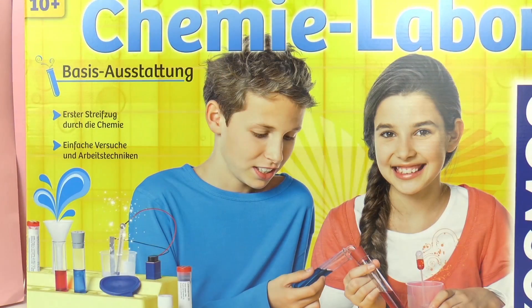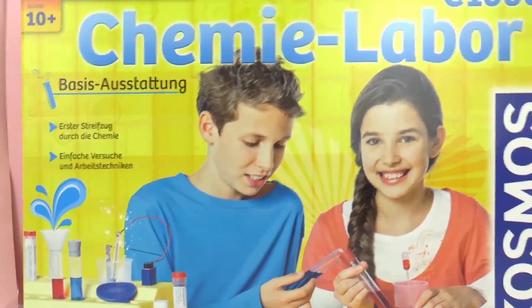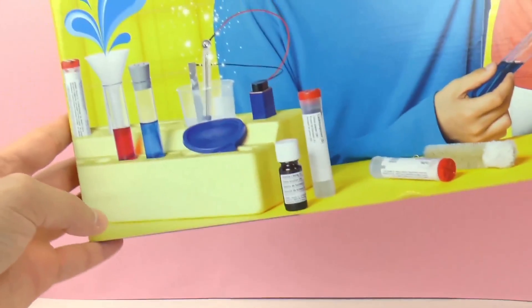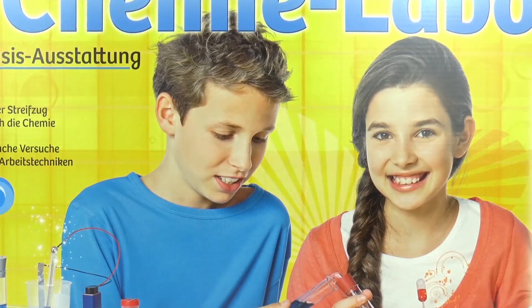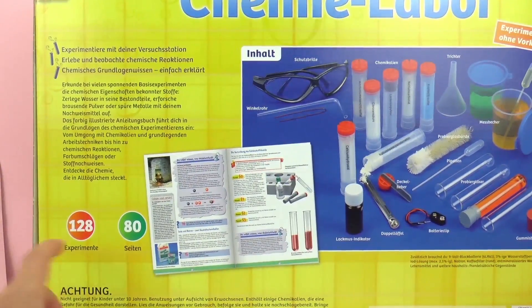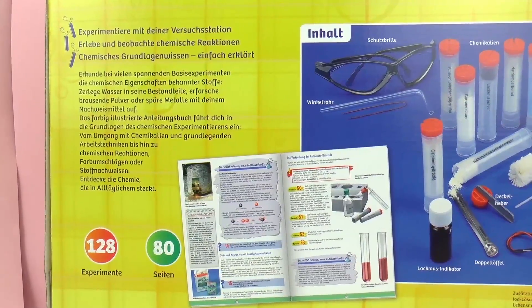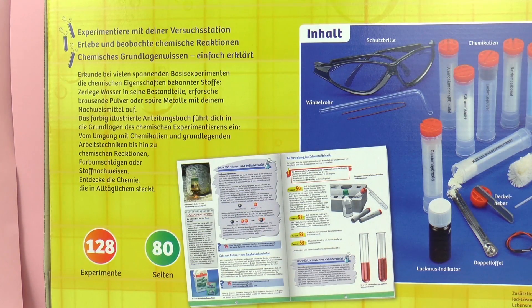This has lots of easy experiments which you can do by yourself at home with the things included. As you can see there's a few things pictured on the front, and on the back of the box it'll say how many experiments we can do. This is the C1000 Chem Lab from Cosmos. On the back of the box we can see we can do 128 experiments with this, and there's also an 80 page book included which explains all of the experiments.